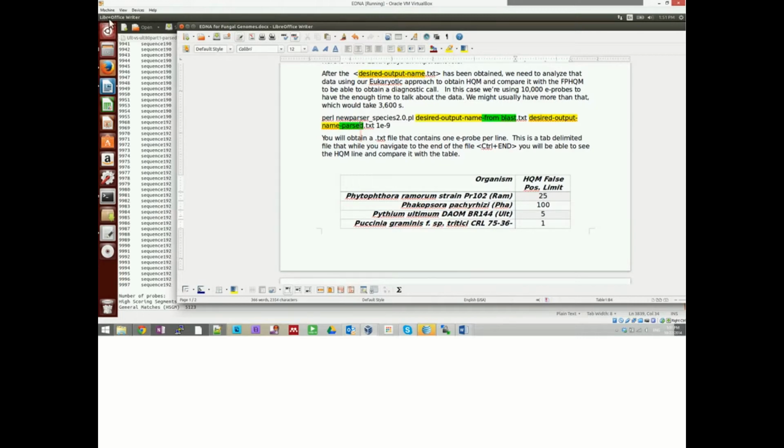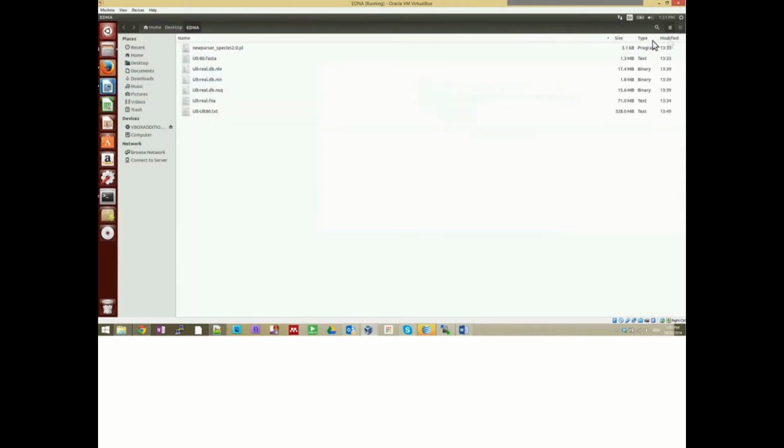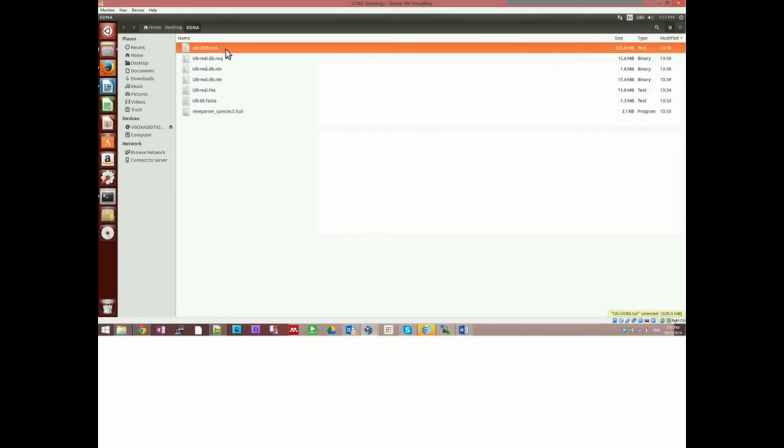Close this one. And I have the EDNA here. And if I list by modified time, it was just done, and it has 328 million bytes. This is the output from BLAST that I was just showing you, okay?